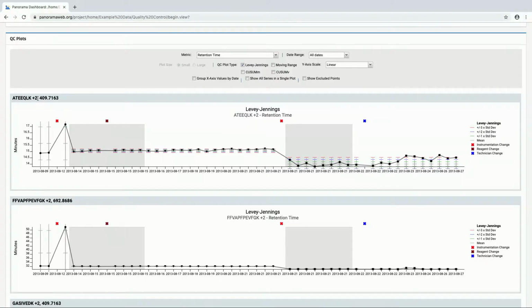And so one of the most important things when setting up any of these processes is to find something that really performs stably. You don't want something that's already bouncing around a lot because, say, you're right on the edge of detection of that thing. You want it to be a nice, stable thing that you're monitoring because you don't want to have a lot of false positives to chase down in terms of outliers here.